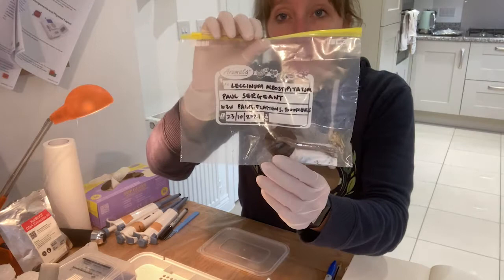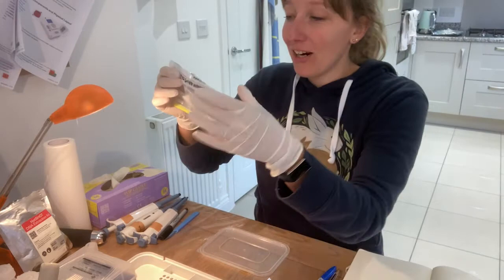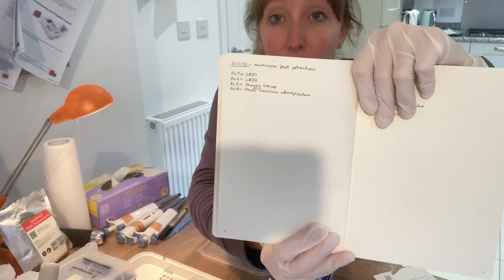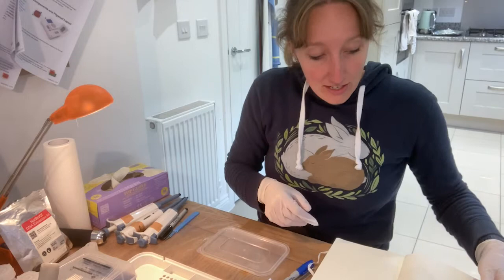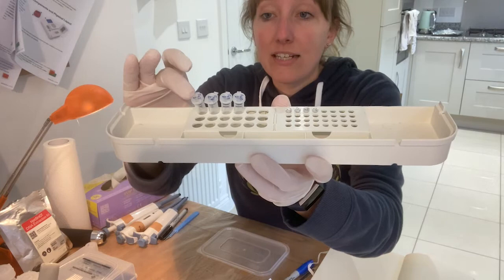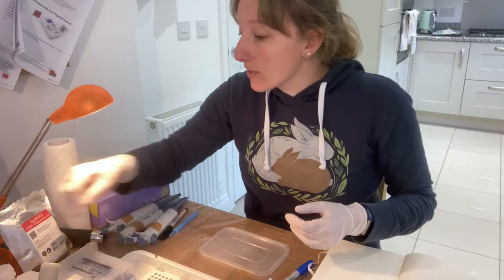Fungus Ten is the one that arrived in the post this morning, already dried — Leccinum alboStipitatum, apologies if that was completely wrong, so I'll stick to Fungus Ten. I've made a note of all of these in my lab book because give me a week and I will not be able to tell you what each label corresponds to. I've also labeled the tubes: the ones with a 'D' underneath are for the dipstick extraction, and the ones with an 'H' are for the hot shot.